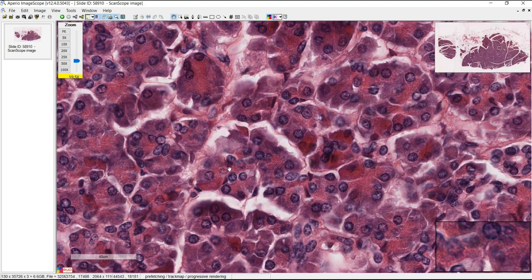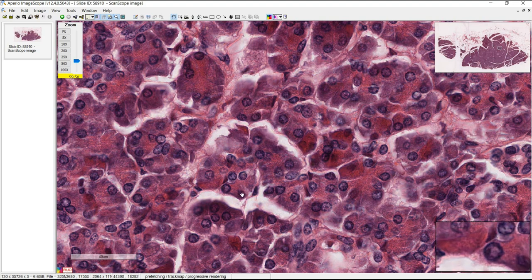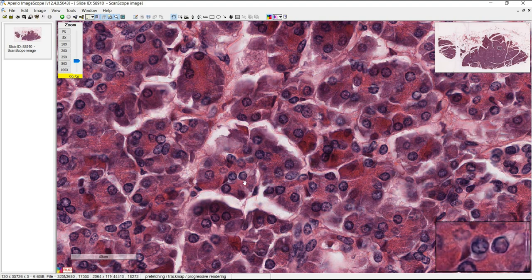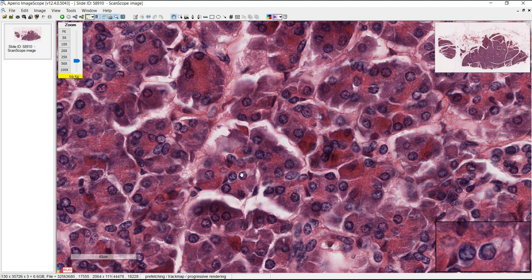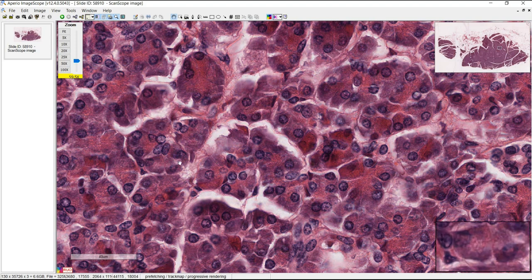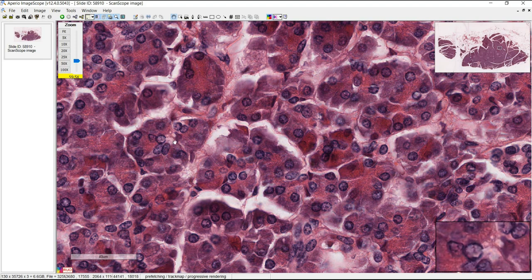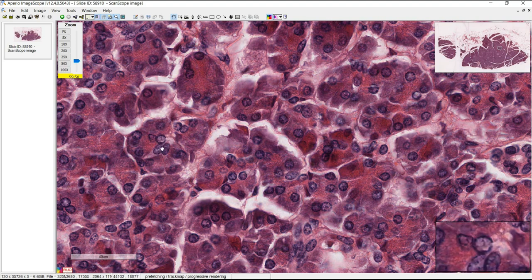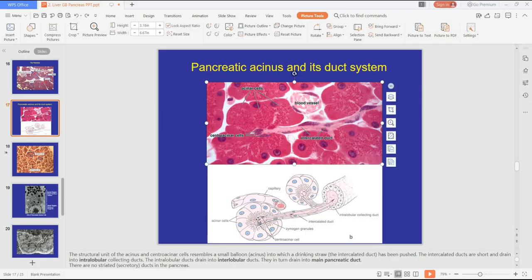Here, for example, is an acinus with a slightly staining area — these might be central acinar cells in the lumen. Same here: here's the acinus, this could be the lumen, and some central acinar cells. These cells are pretty small and are part of the intercalated duct. They secrete bicarbonate.